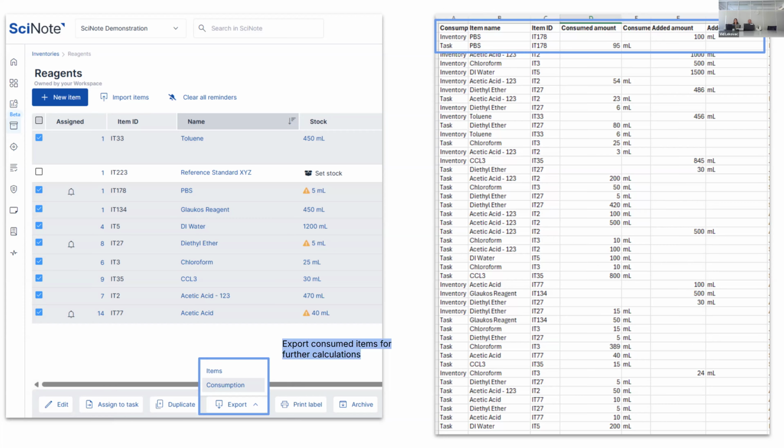Okay, and lastly, this is something we released recently. It's not inventories, it's not ELN, it's actually an SOP library, so protocol templates. Protocol templates now also have item templates. Let's say you're doing one SOP, but it always has the same items. You can have those created in the library, assign those to your ELN, execute them, and then if something changes, right?